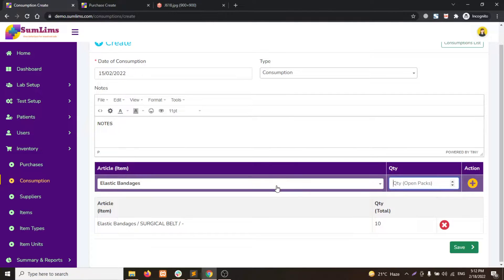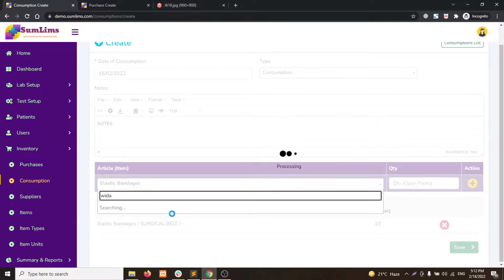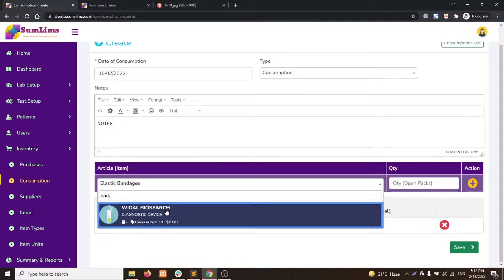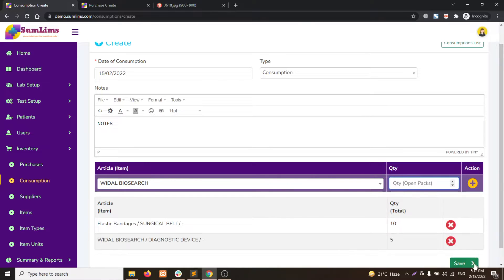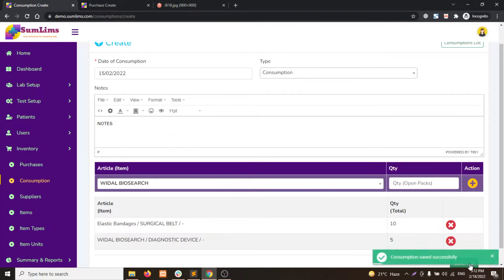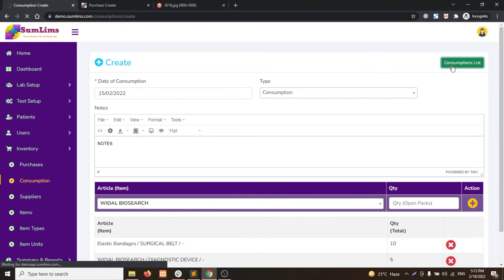For example, we have a new product consumed. We write down the quantity 5, click on add to table, and click on save. So this way you can create the consumption or wastage of anything.